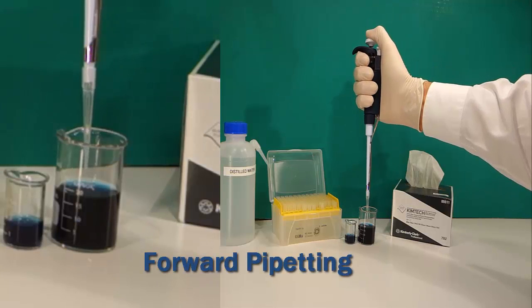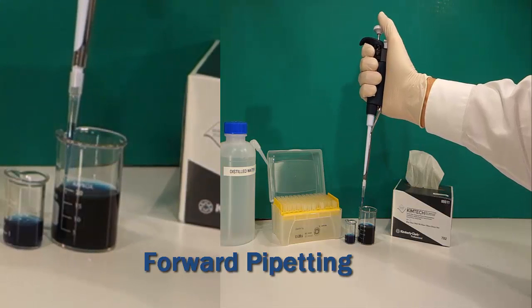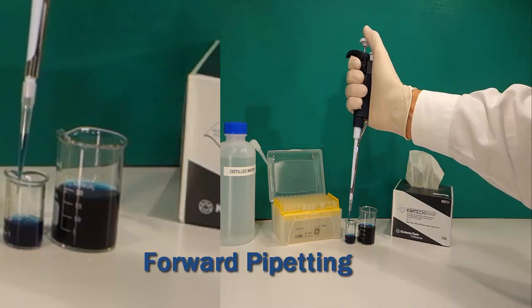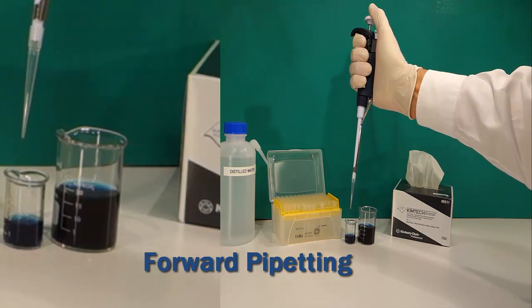The primary stroke is set by the micrometer and is responsible for volume. The blowout expels remaining liquid in the tip. Pipettes are most accurate and are calibrated using the forward pipetting technique, the most common method of pipetting.